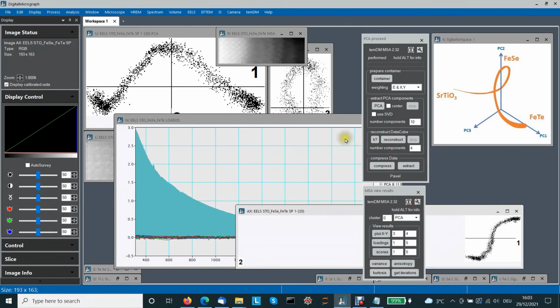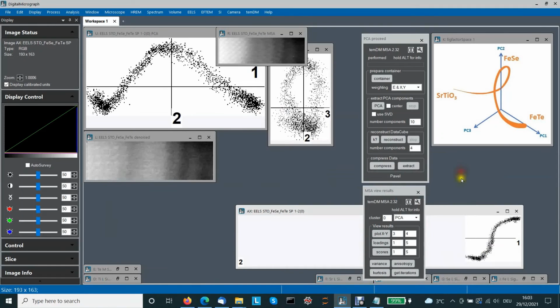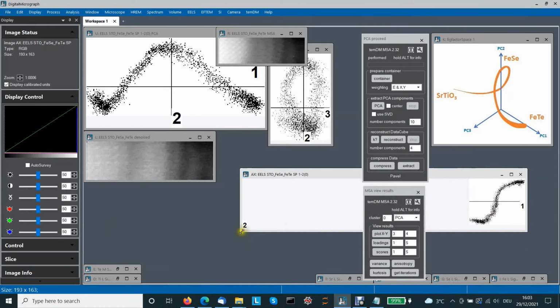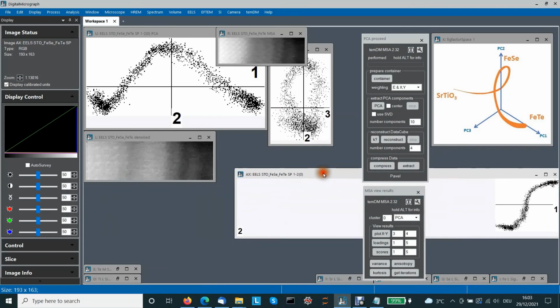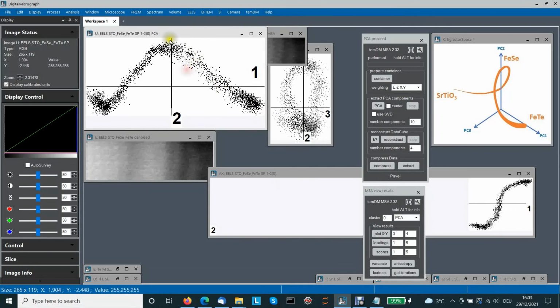Well, now let's look at the loadings; we probably do not need them. Let's look at the score plots. Second component versus first one. It looks quite different from what we had in the previous case. And that is because now the scatter plot includes the 0 point, the point where all counts in all channels are 0, and that is somewhere here.